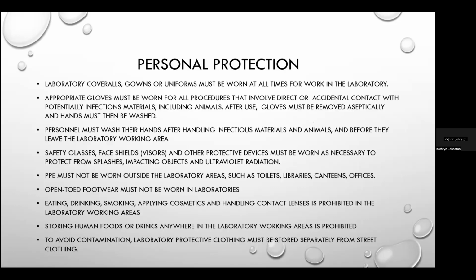Personal protection, we talked about this earlier. But consistent with standard precautions, gowns or aprons should be used. Gloves should be worn when there's anticipation of direct contact or accidental contact with potentially infectious material. But that being said, it's not mandatory that you wear gloves while handling plates, transferring colonies with use of loops or such. But it is mandatory that you perform hand hygiene after completing that work, and especially prior to touching your face or mucous membranes. For example, when you're going on tea break or to the restroom.